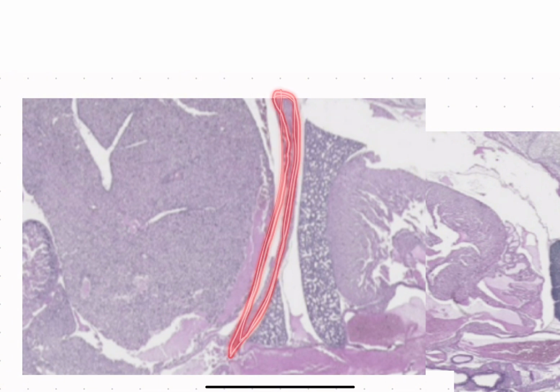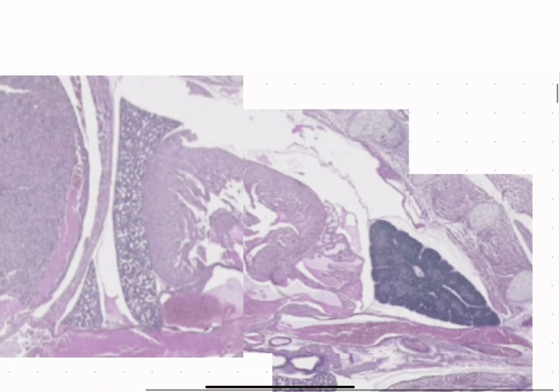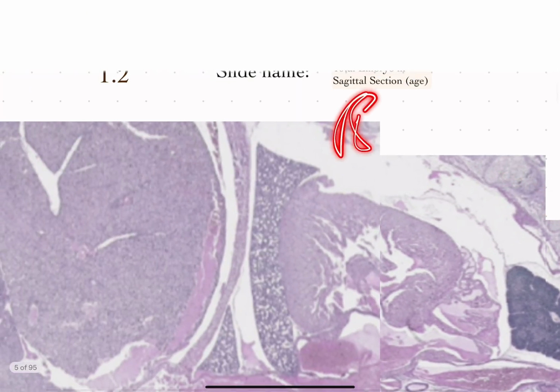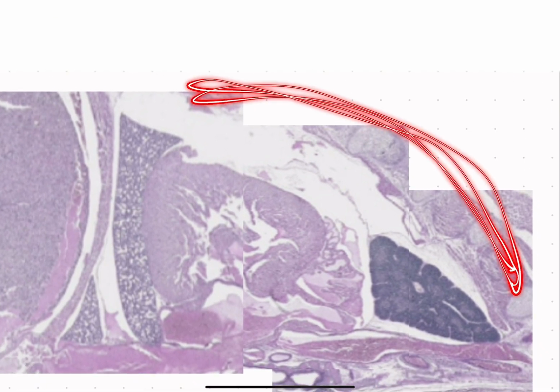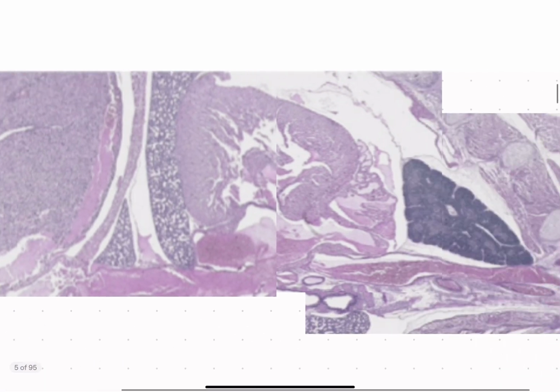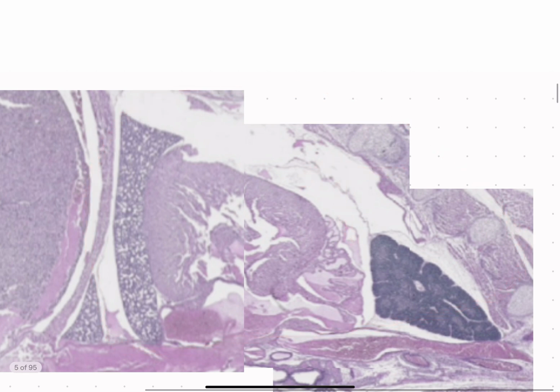And I hope you saw that signifier of a diaphragm that separates the thorax from the abdomen. Another little Easter egg that I hope you guys noticed are the ribs. So you can see there the ribs are here, and you can't really see them. They should end here. Obviously you can't really see that now, but this is the section where the ribs are. So obviously they wouldn't continue here, right? And that is also another signifier that this is the thoracic region.